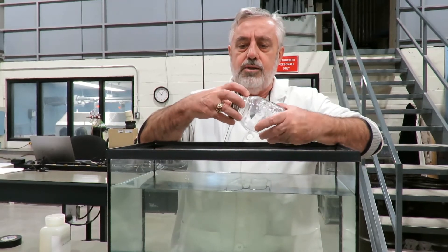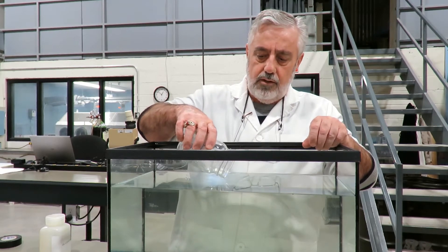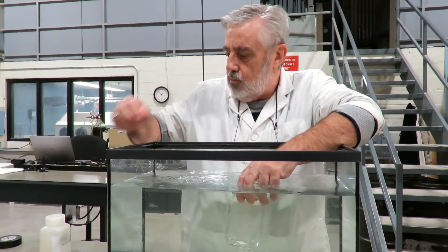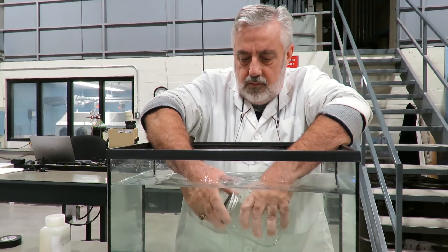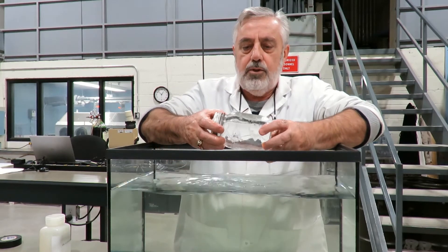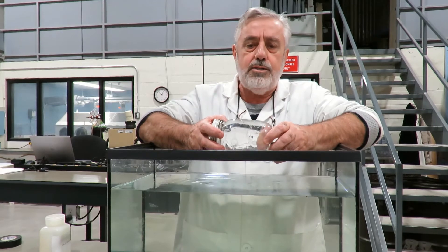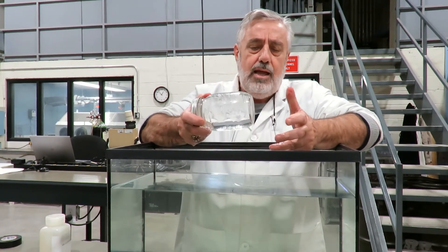I still prefer the old mason jar, and here's why. I introduce the jar lip-first into the water and slowly rotate it around — notice I'm not splashing any water or creating any bubbles at all. Then, still underwater, I put the lid back on the jar and seal it nice and tight. When you pull it out, make sure there are no bubbles, because radon will escape into any bubble and will be lost when you open the jar — meaning you'll count fewer radon particles than there should be.